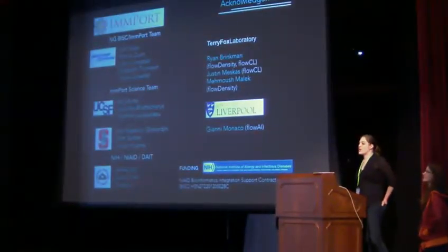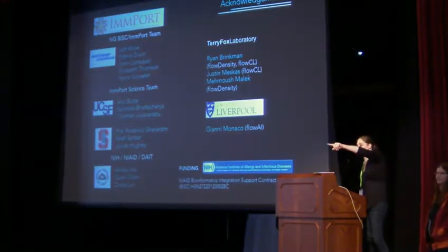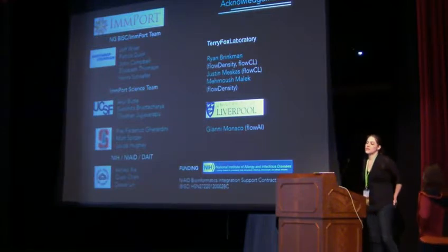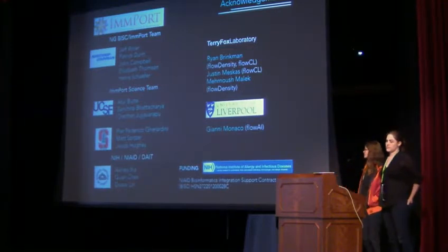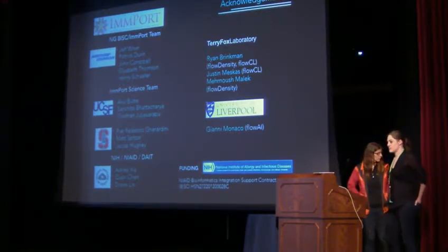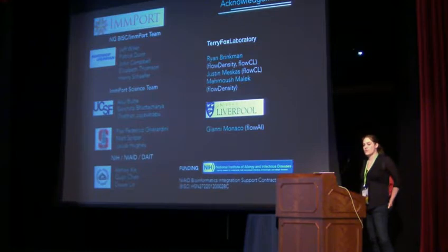Yeah, so the question is, why are we using Plotly and not Shiny? I think John should answer, because he's the one who made the decision. I think the short answer is that with Shiny, you'd need more work for it to work within Galaxy. We wanted something that was easy to manipulate.